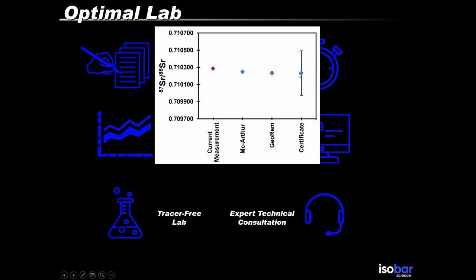And this is what the certificate is telling. The certificate of the strontium standard says this range is acceptable if you analyze this standard. So this is what we do, and we are within the range, and very close to the other ranges.